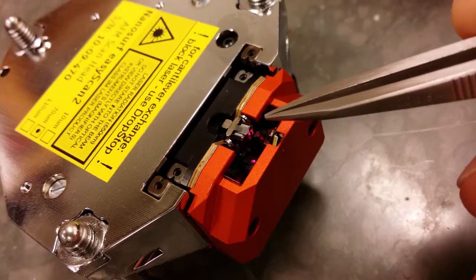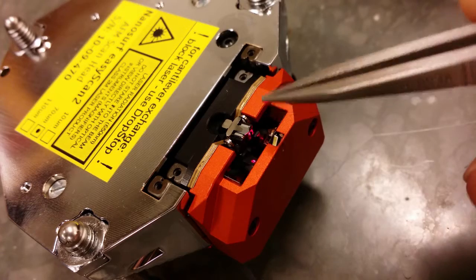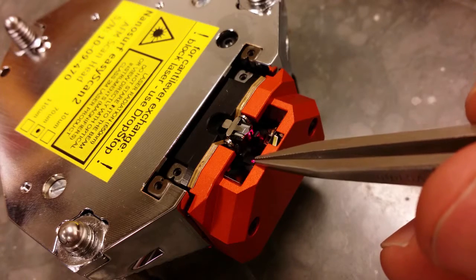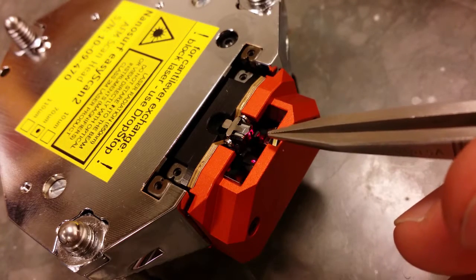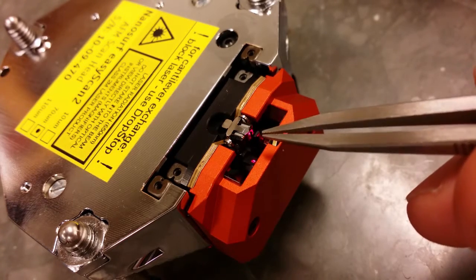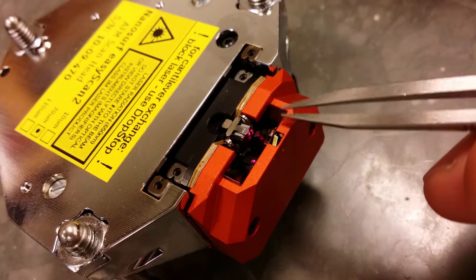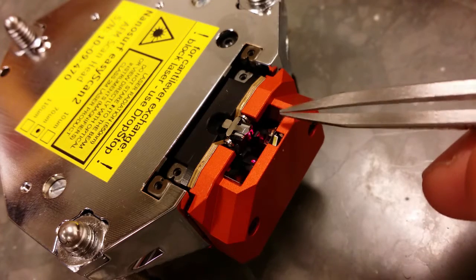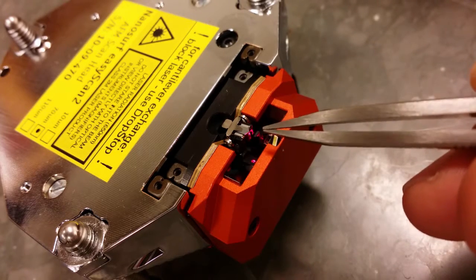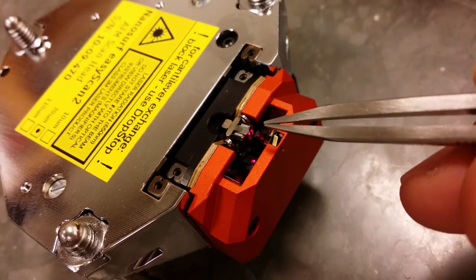It's barely visible. This scanning head has a coarse motion up and down so that it can approach the surface. But when it's done that, it starts to scan with the piezoelectric motion. The laser light you see here comes from this side, goes up, is reflected in the tip and goes down to a sensor below here. In that way you can measure when the tip deflects when it touches the surface. Due to deflection, the laser light will change position on the sensor here. If you then measure the position of the laser spot on the sensor, then this will be correlated to the deflection of the tip and thereby correlated to the force. The amplitude of the force is thereby given because you know the spring constant of the tip.